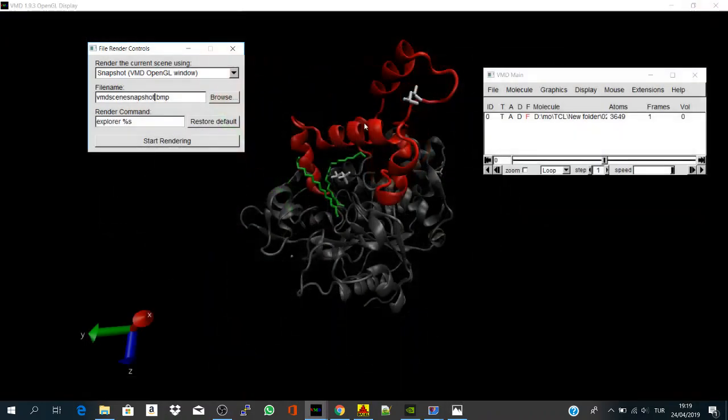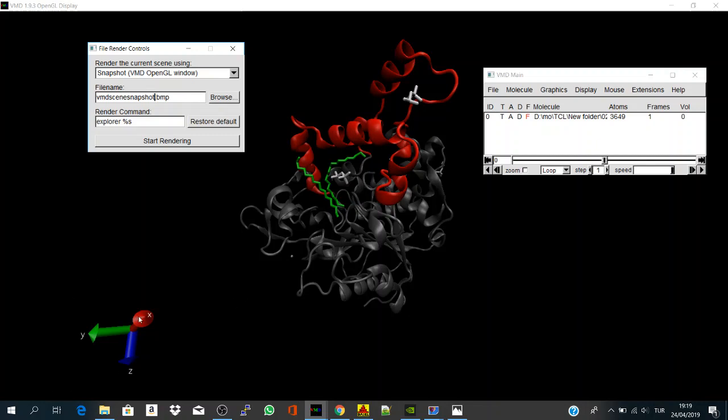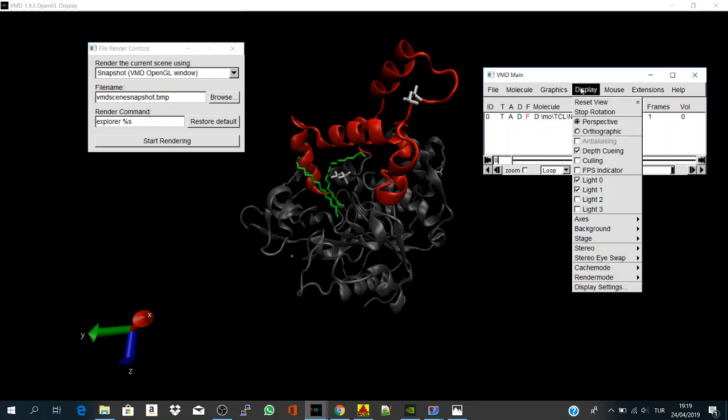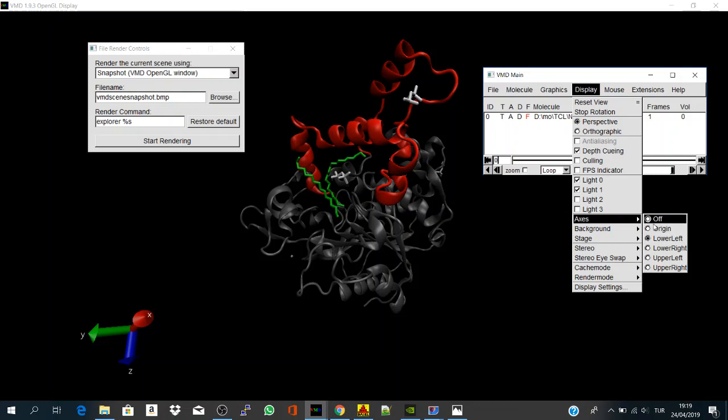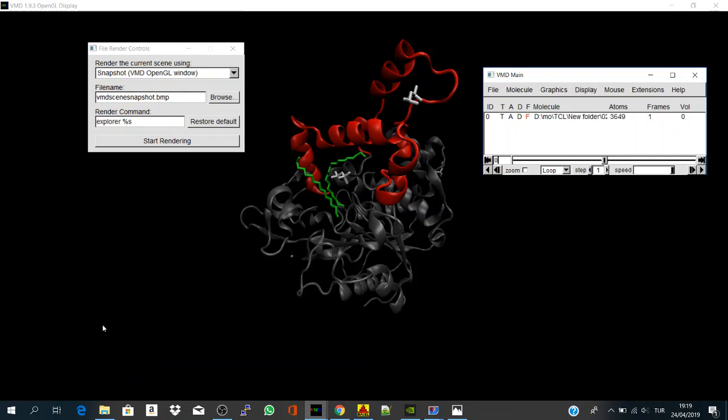You should modify your representations a little bit for rendering, like for example, you should get rid of this axis. If you say display, and axes, and you say off, so it disappears.